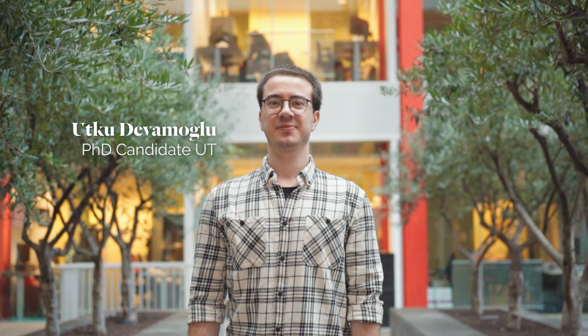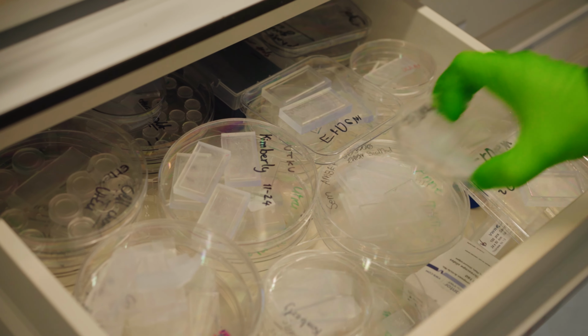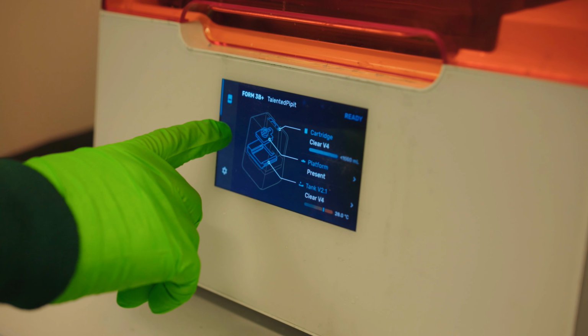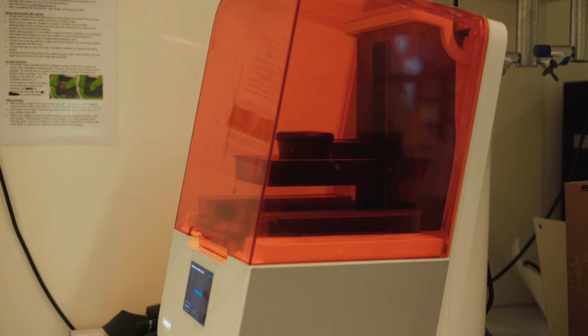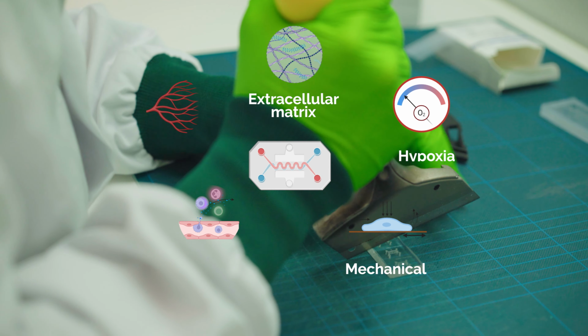In the FibOoC project, my role is to combine biological and engineering perspectives, and mostly the idea for me is to design the models here and also to validate them with the cell culture. Also incorporate some engineering aspects. We have identified important characteristics of fibrotic diseases which we are incorporating one by one in our model.